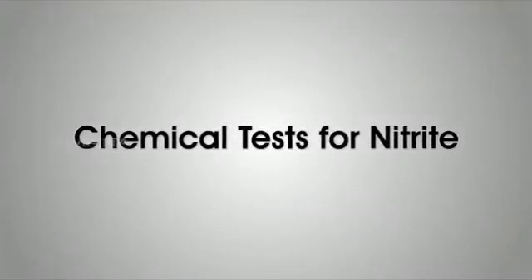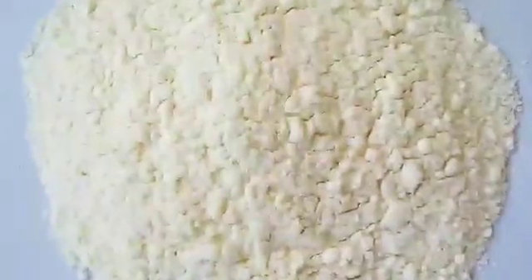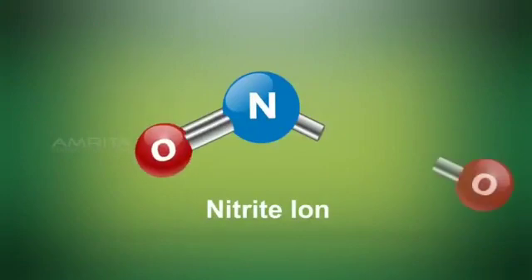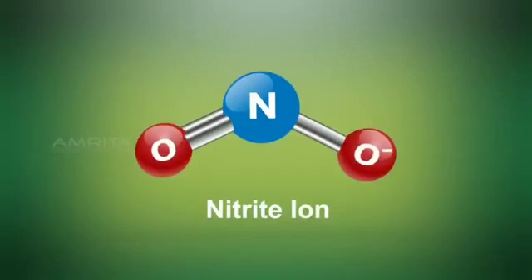Tests for nitrite. Nitrites are inorganic compounds containing the nitrite ion, in which a nitrogen atom is bonded to two oxygen atoms.